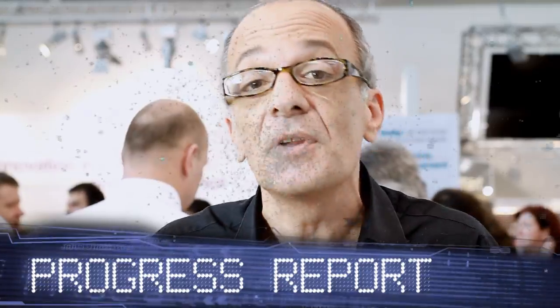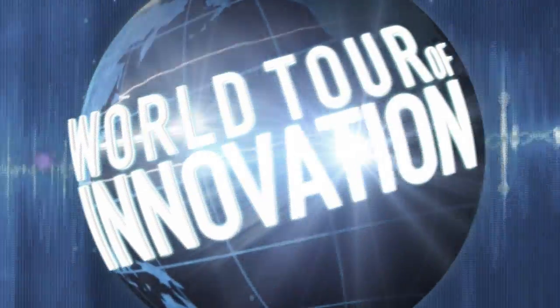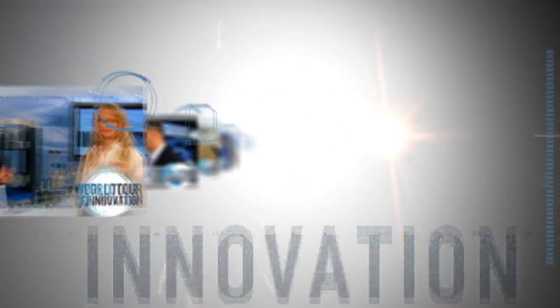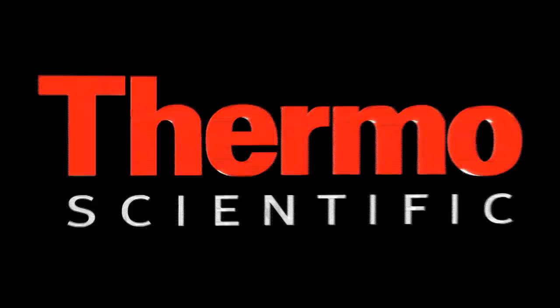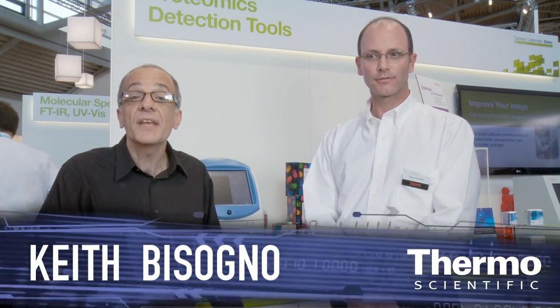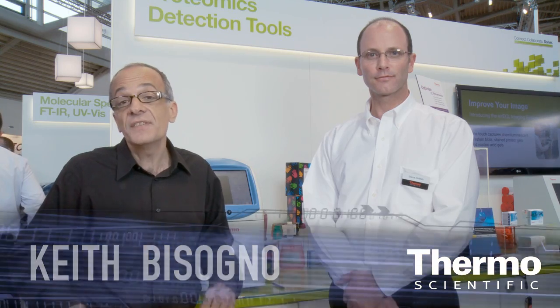We've got a brand new innovation for your gel documentation and Western blotting. We're in the Thermo Scientific Technology exhibit here at Analytica in Munich, talking about gel documentation and Western blotting with an expert, Steve Shifflett. Steve, we have not only an innovation but an instrument that's really going to change our customers' lives in the labs and make it better. So talk about it.